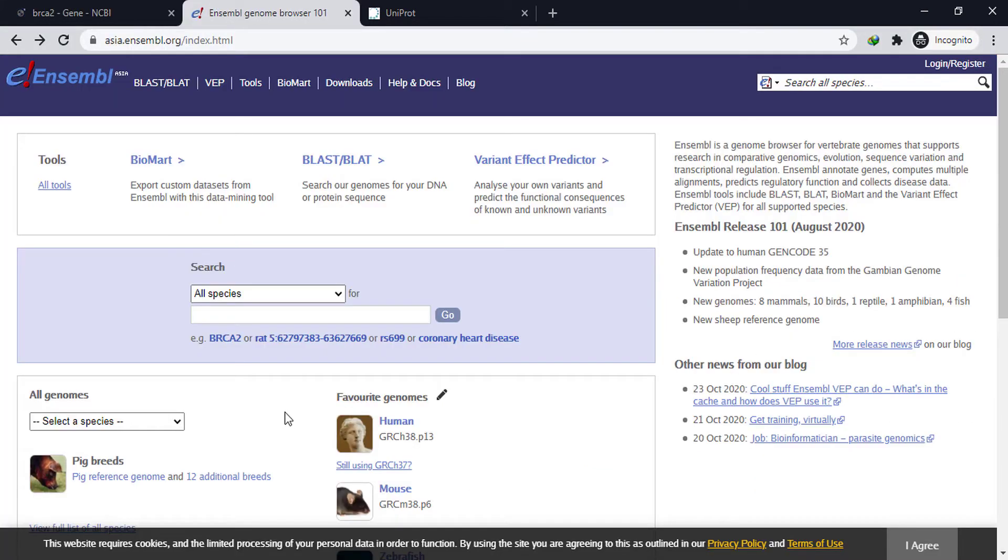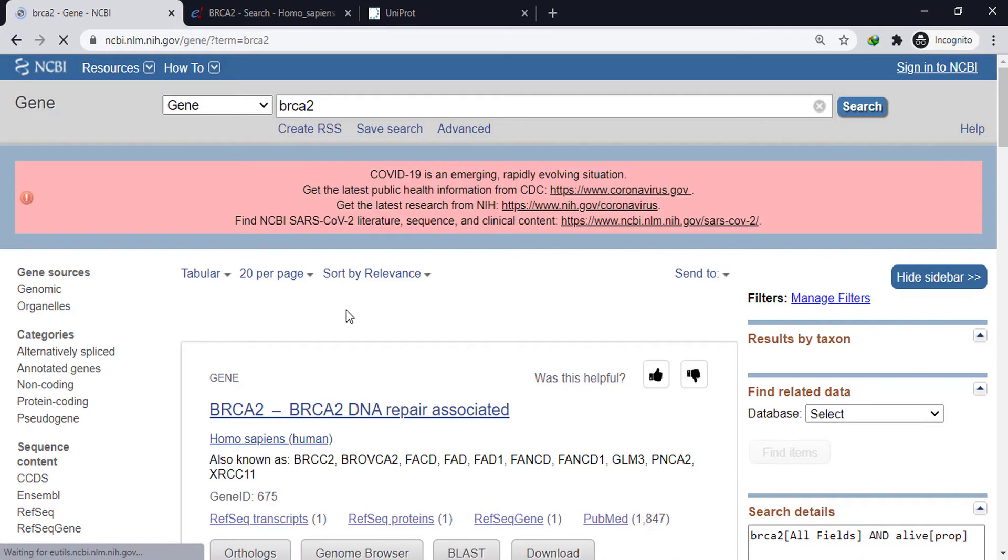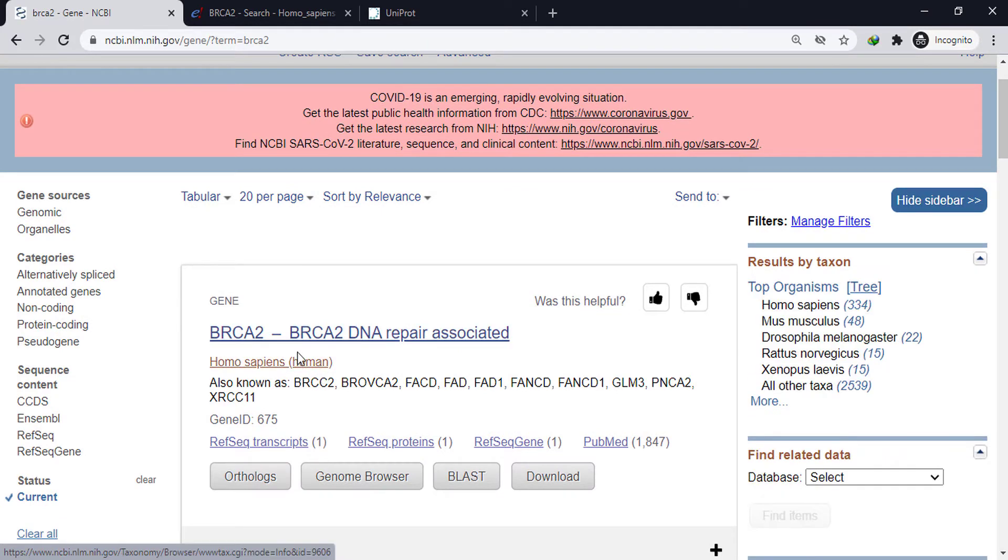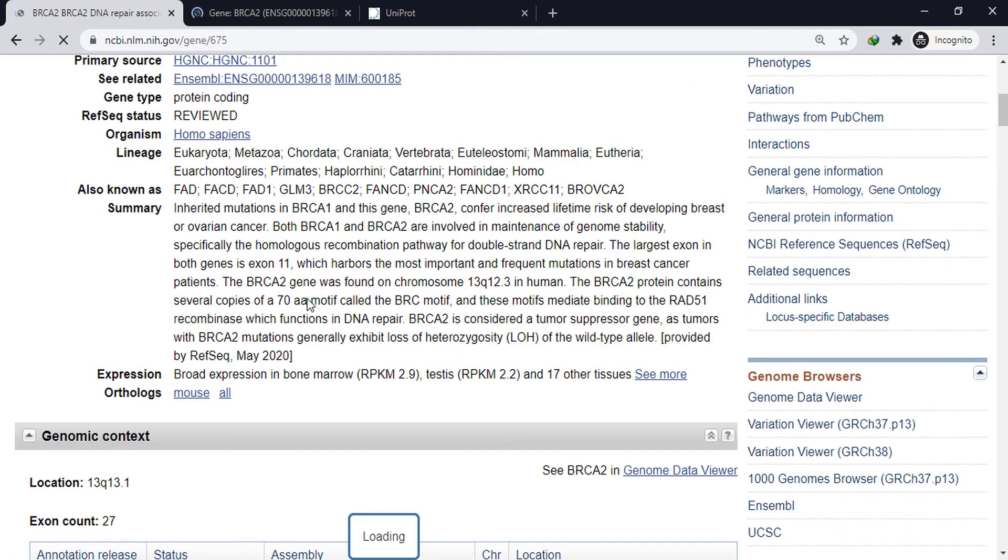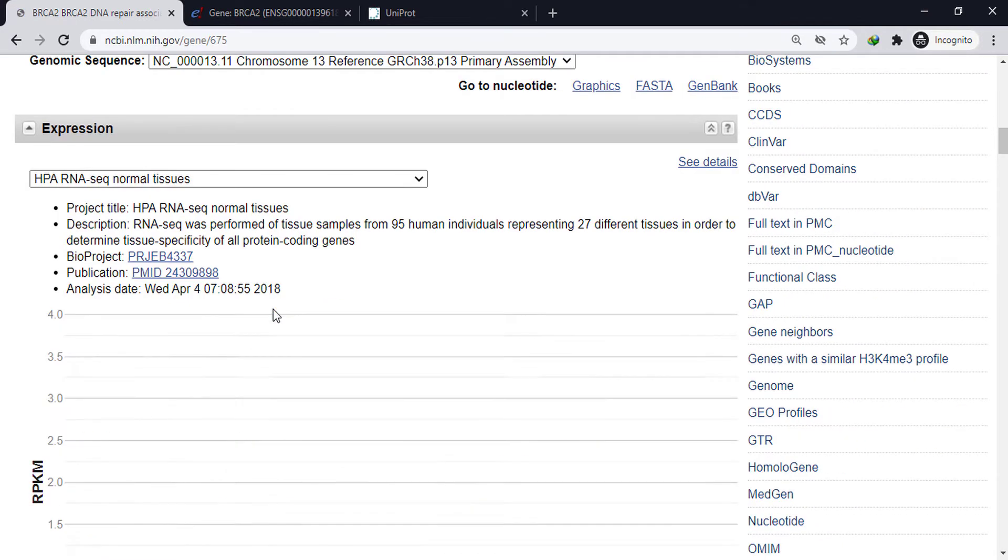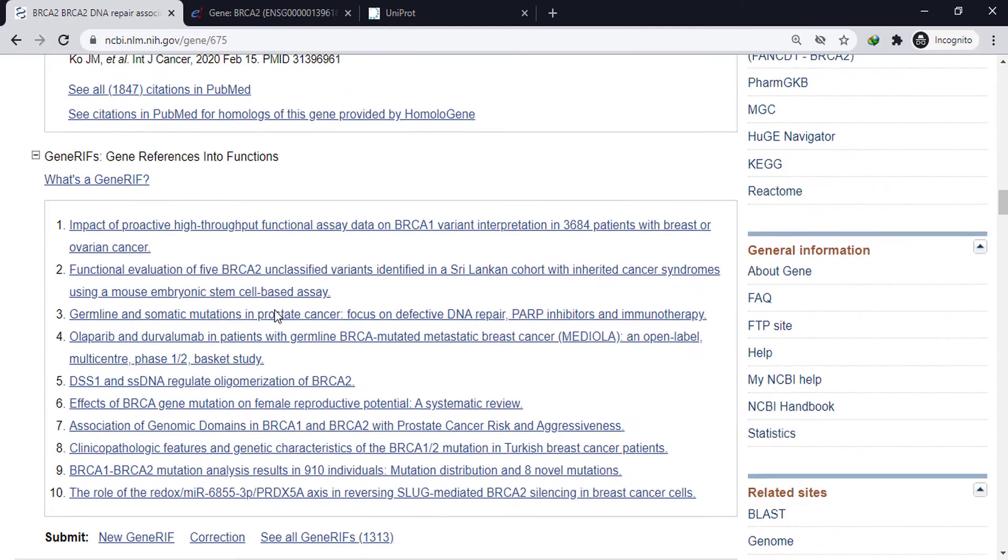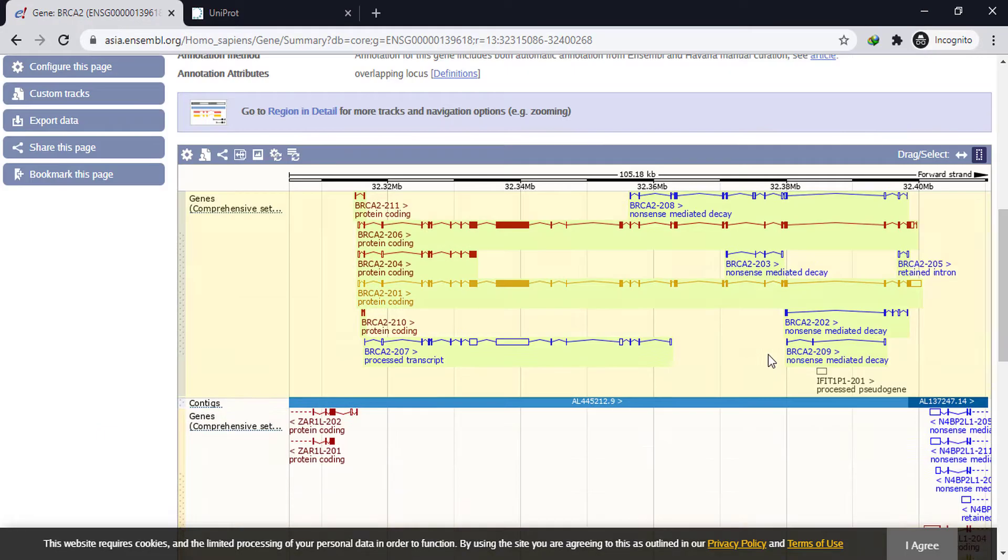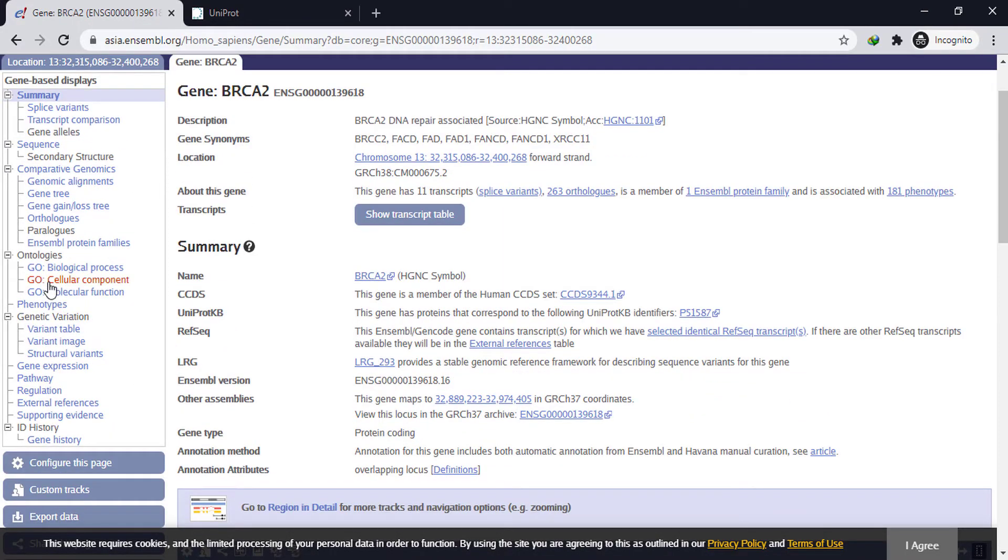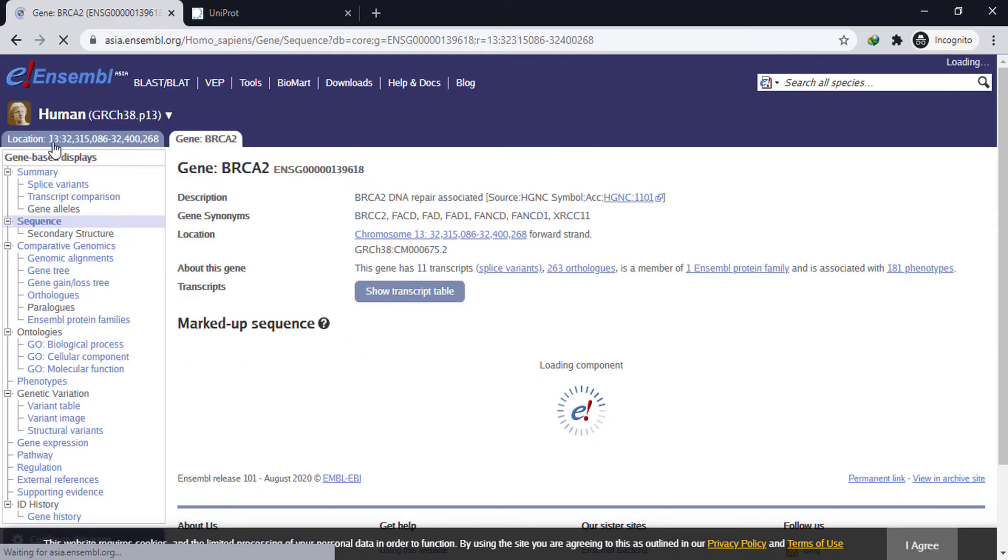Similarly, we can search by symbol. So this is the homo sapiens gene. We don't want all the theoretical data. We only need the sequence to construct a phylogenetic tree.